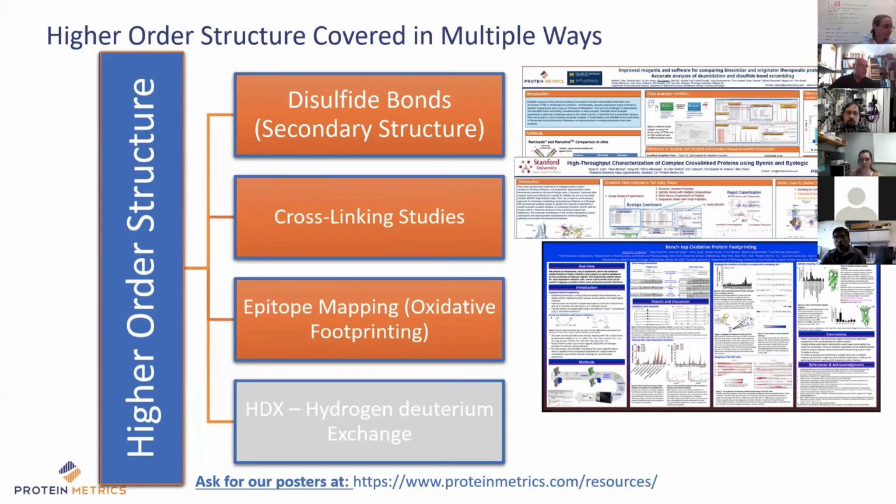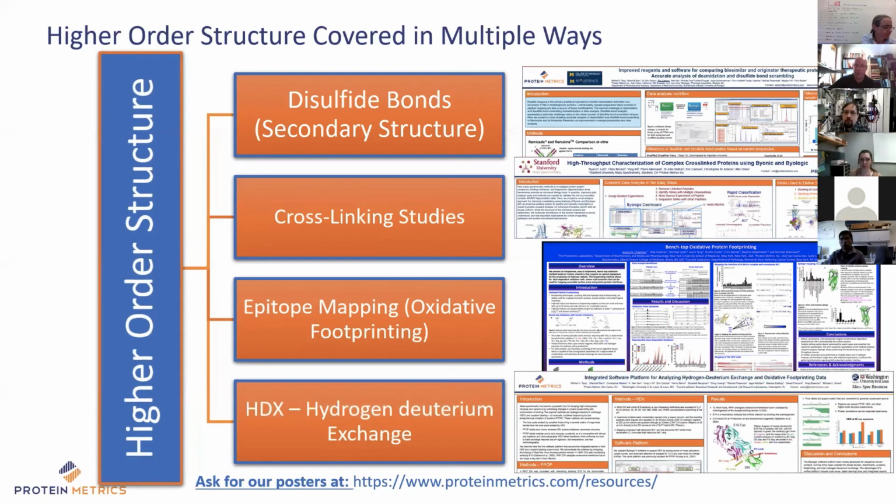And then, of course, the hydrogen deuterium exchange, and one thing I want to call out here is the kick in the pants that we were given many years ago by Michael Gross, who said, you better start organizing this stuff so that we can process it properly. And of course, being able to look at HDX data and footprinting data at the same time is pretty critical for a lot of places too, because they might be complementary in information.